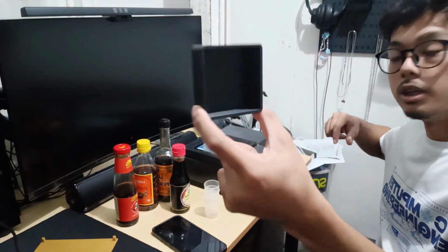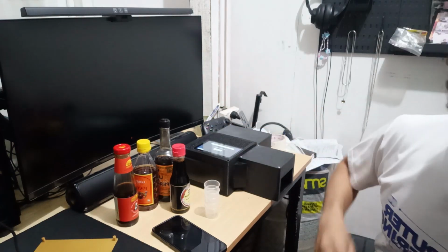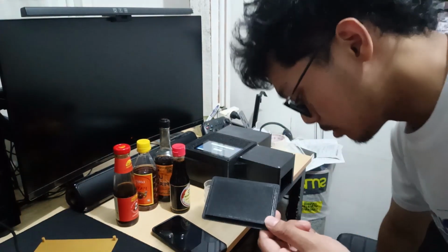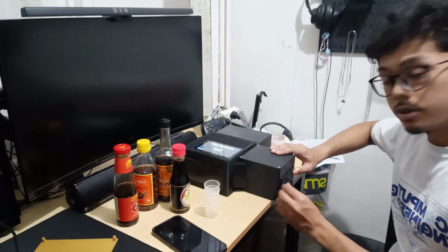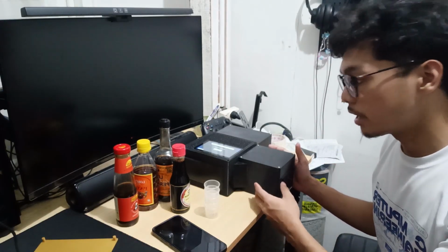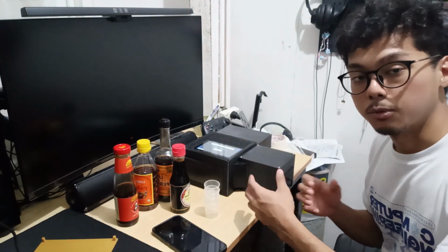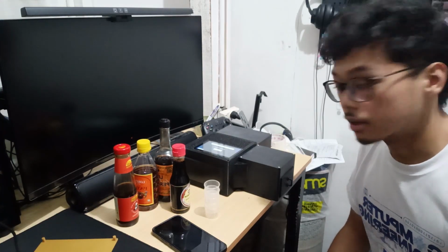I have this lid to close the exhaust fan, and then I also have this cover to cover the entrance of the gas sensor or the chamber sensor. So we want to create a sealed environment for the sensor and the sample, so as to avoid the samples to be interacting with the outside elements. So we want it to be very isolated.